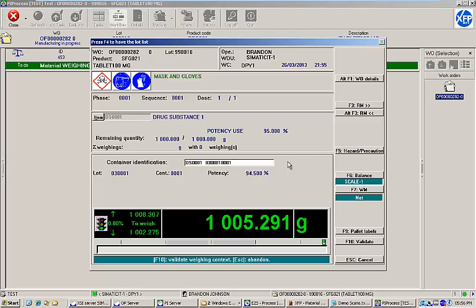It is also possible to define a required weight range within the MES. In the case of Drug Substance 1, the tolerance is set to plus or minus 3 tenths of 1%.